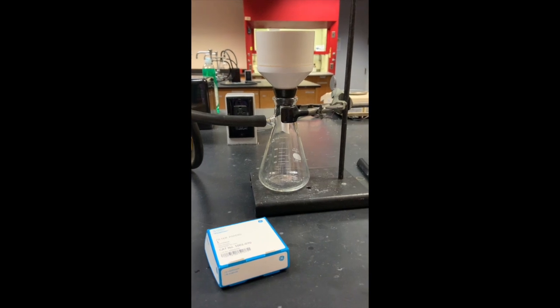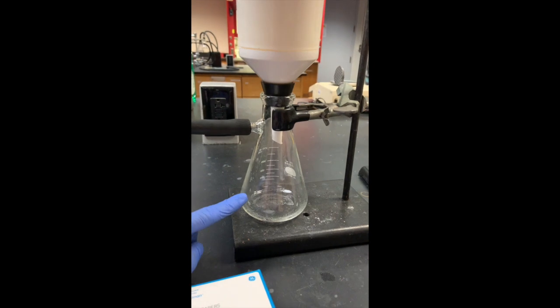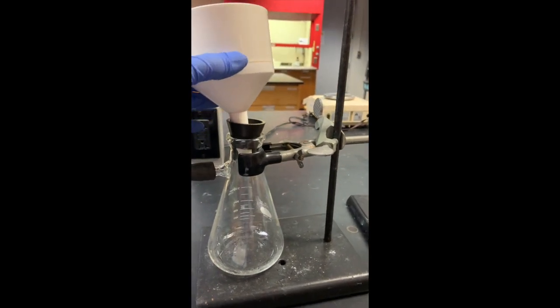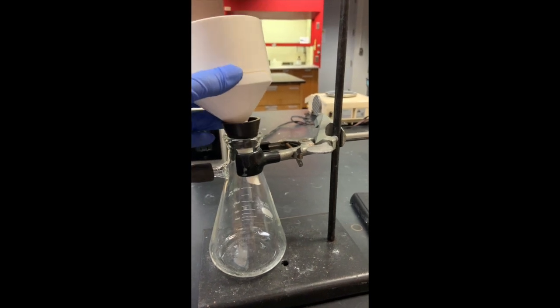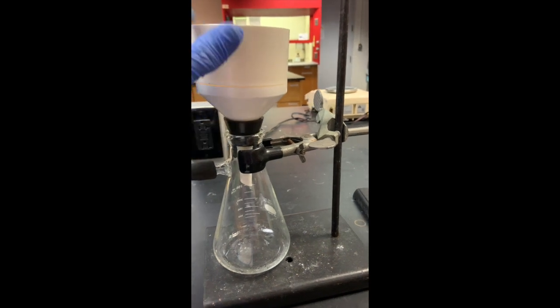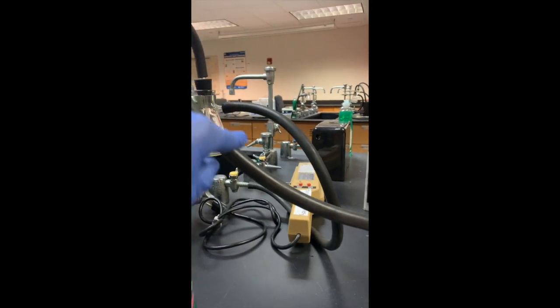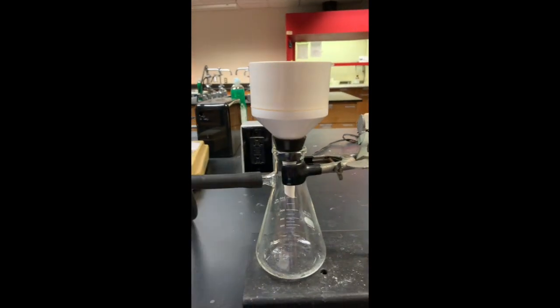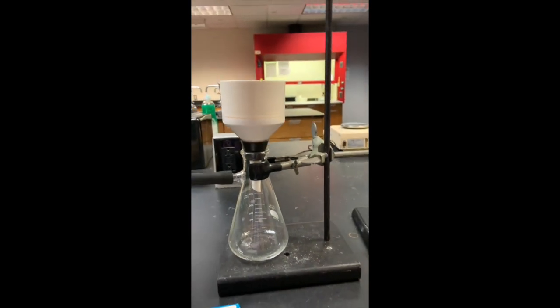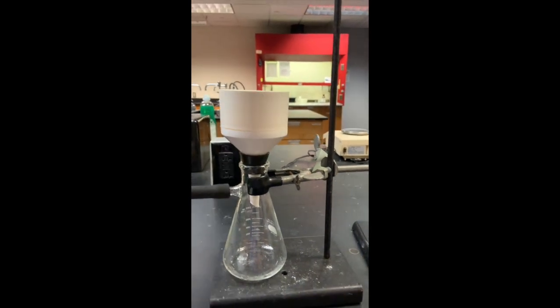Here is my vacuum filtration setup. I have a filter flask, a funnel, a Buchner funnel, I think it's called, a neoprene adapter, which fits into the neck of the flask. I have my vacuum intake going here, and it connects to my filtration flask, and I'm holding it all together with this clamp setup.